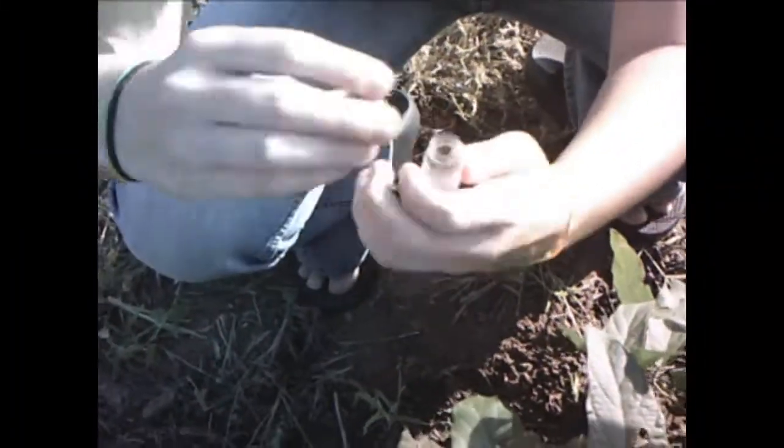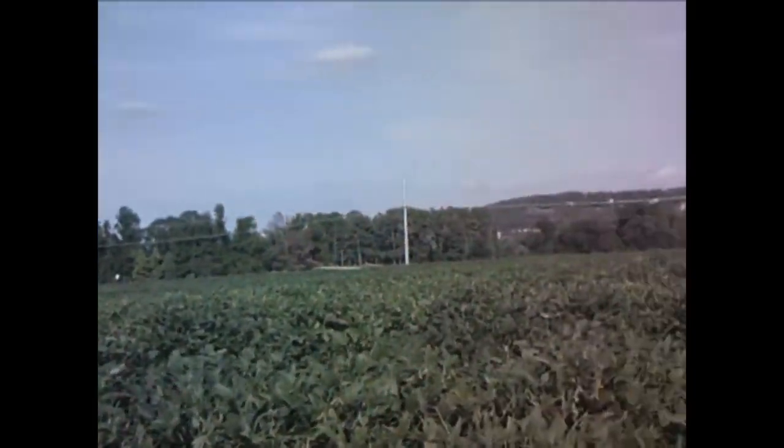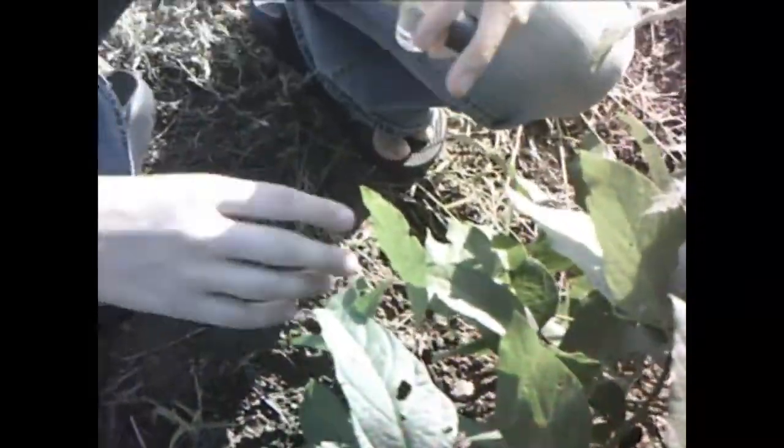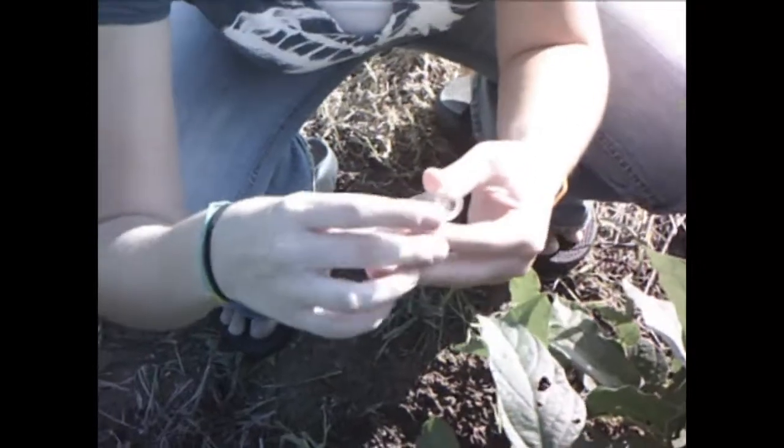What you want to do is take the cap off and just search around for some small insects. Once you get real deep in here and you find some, when you get up in this plant and you find yourself some good insects, you can just pluck them right off and stick them right in the alcohol. This is going to preserve them so that you can keep your insects as long as you want to.